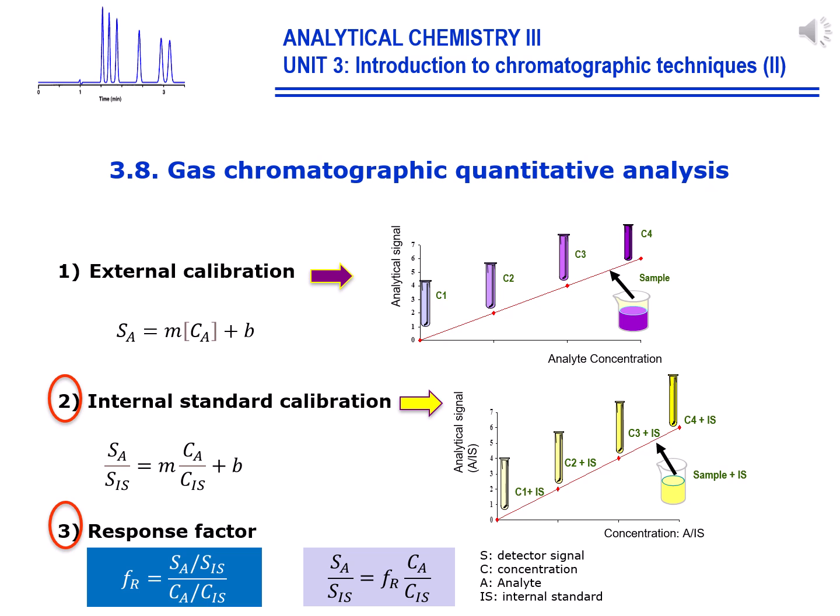Gas chromatography can also be employed with quantitative purposes by transforming the analytical signal of the detector into concentration. For this, it's necessary that the detector has a linear operating range that covers the expected concentrations of the analytes. We could apply an external calibration. In such a case, we would construct the linear relationship between peak areas and concentration.